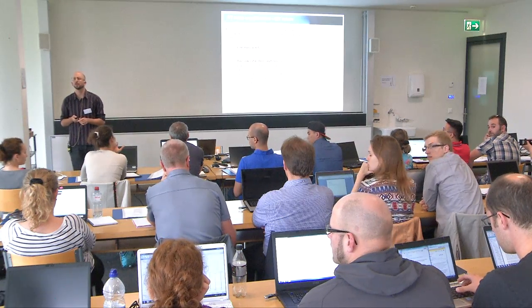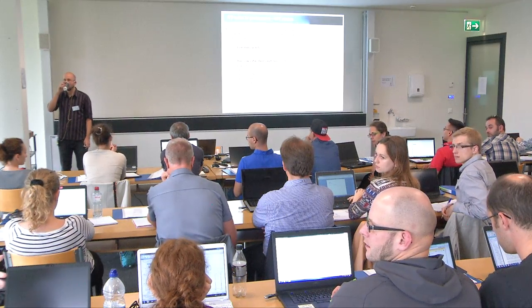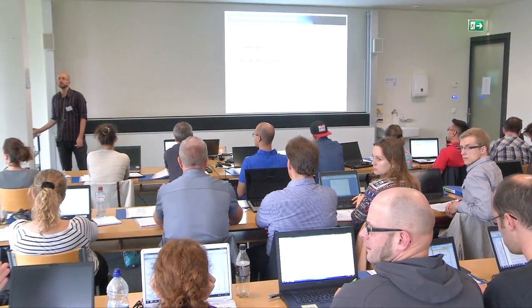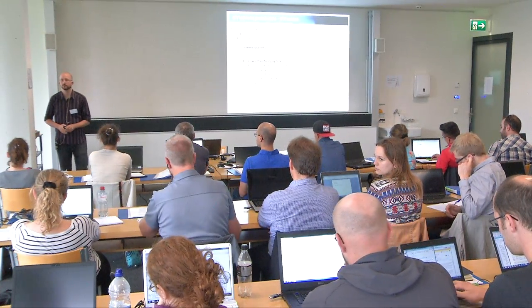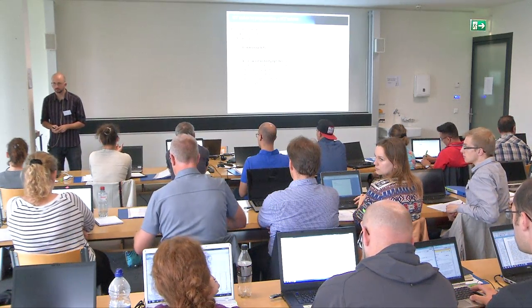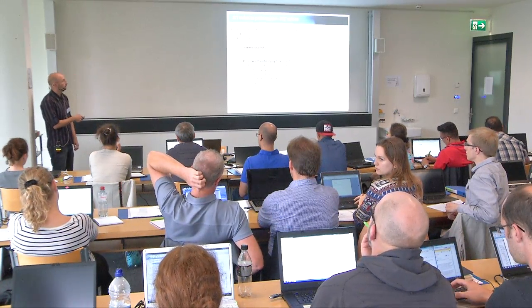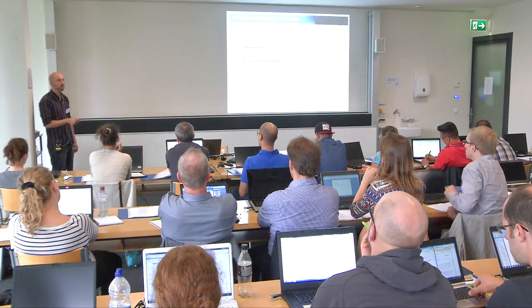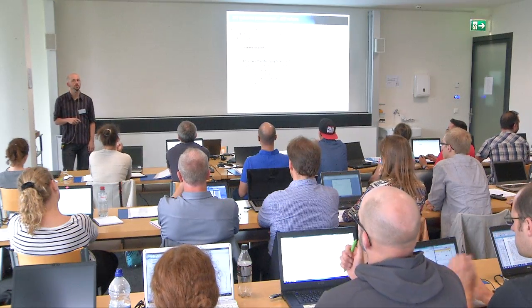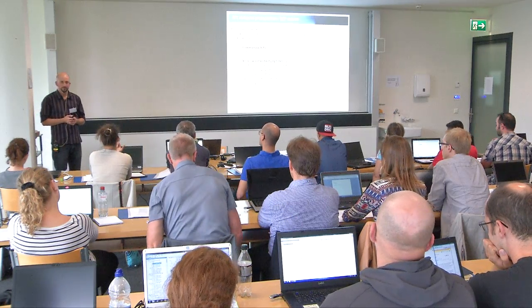I would guess that most people working with these retention time standards buy commercial kits, and a lot of people have already worked and tried to establish or found out the best transitions. Are there any repositories where I can get these transition lists, maybe even the optimized parameters for different instruments? For the commercial kits, it's provided already when you buy the kit. If people use their own standards, then it's up to them to deposit or not deposit this. So this I'm not aware of.